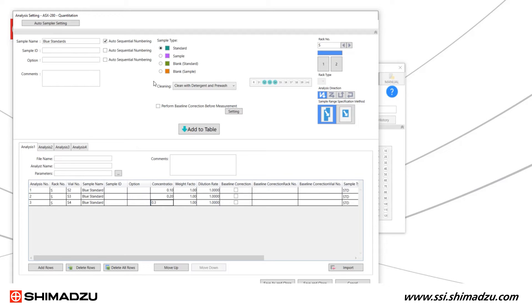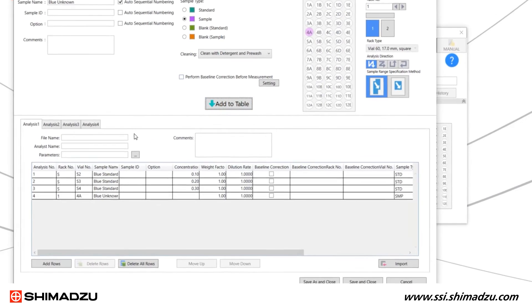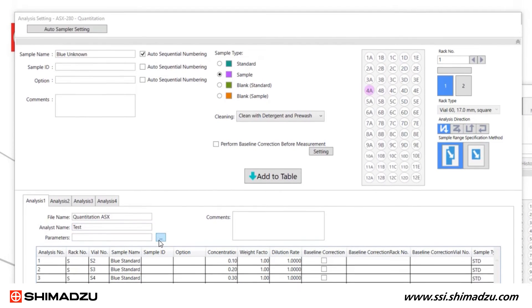Go back to the Sample Type section and select Sample, then assign vial 4A as Unknown Sample. Click Add to Table — the unknown sample information will be added to the sample table. The Auto Quantitation module enables you to set up to four independent quantitation analyses. In this demonstration, Analysis 1 is used. Under the Analysis 1 tab, enter file name, analyst name, and select the quantitation parameter file saved previously.